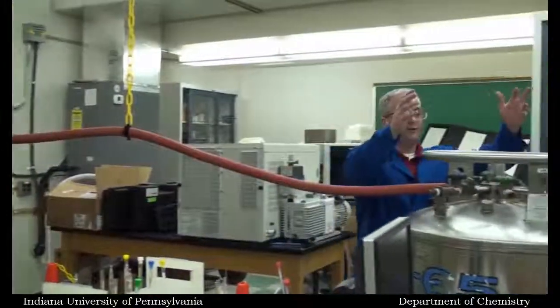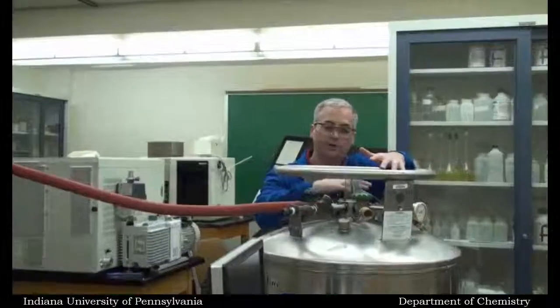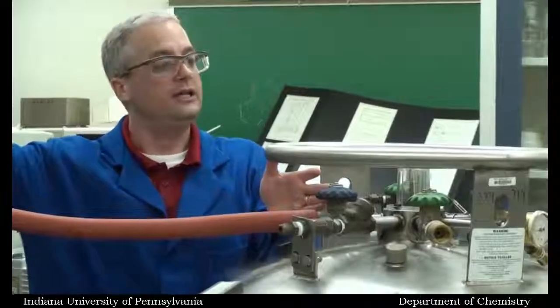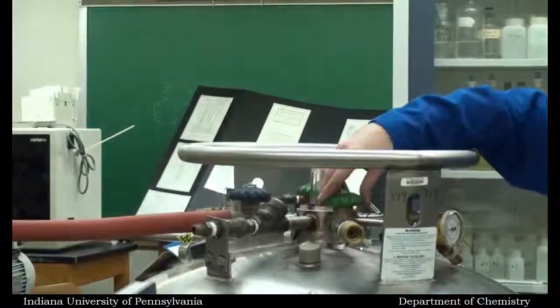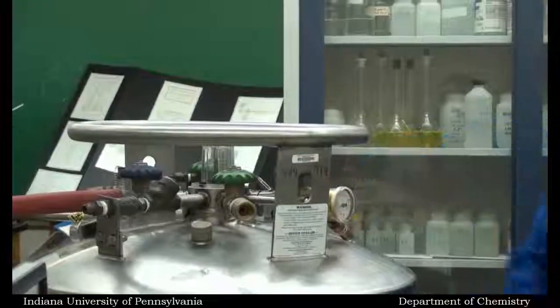Some comments about the Dewar, why it's transferring. If you look, we can have here a pressure buildup. You don't touch that. That just stays the same. You have your liquid. Of course, the liquid is the one in which we're using to transfer our liquid nitrogen. We have our gas use. So if we wanted gaseous nitrogen, we would use this. And this is our pressure relief valve.